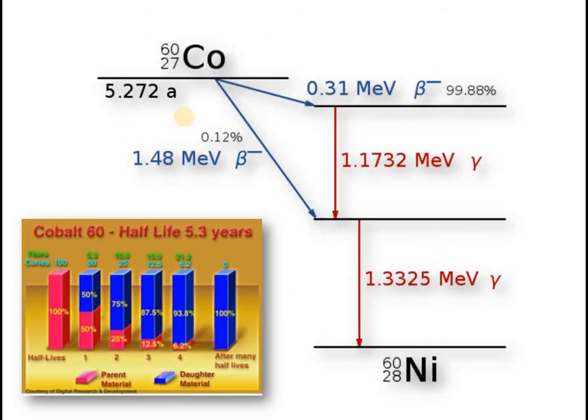And here a typical schematic is shown, a decay diagram of cobalt. You can see what type of gamma rays are emitted, what type of other radiations are emitted. So it is obvious that the emission of beta is irrelevant. Once you know the emission of gamma ray of this much energy, 1.17 MeV, then we can conclude that the element of interest is cobalt.